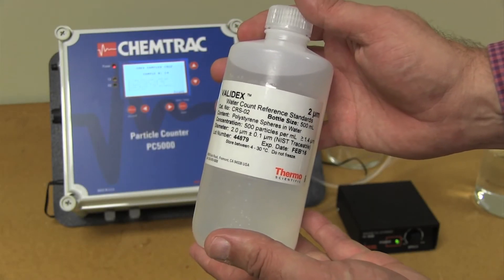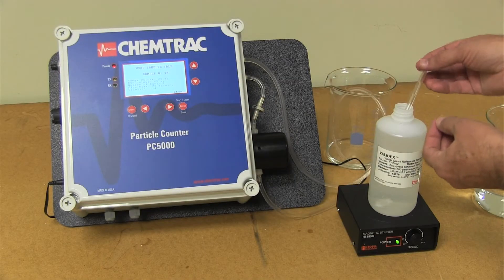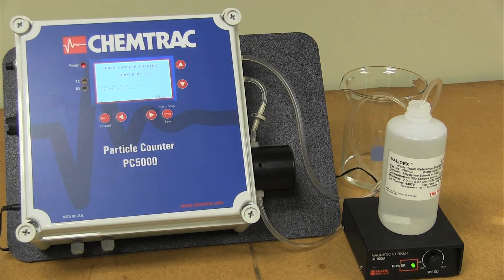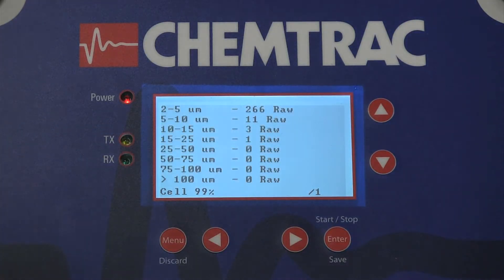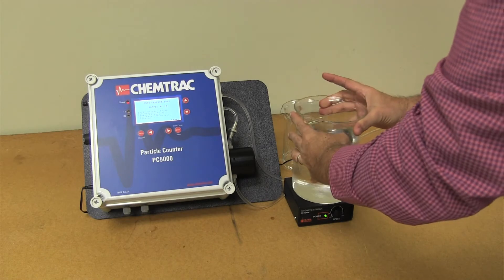Validation standards of polystyrene latex spheres can be used to check the particle counter's calibration. With the 2 micron, 500 particle per mL standard, it is expected to see only half of the 2 micron particles in the 2 to 5 micron range. Since this particular standard expired two years ago and the presence of larger particles is likely due to some particles clumping together, it is good to go ahead and do a calibration.